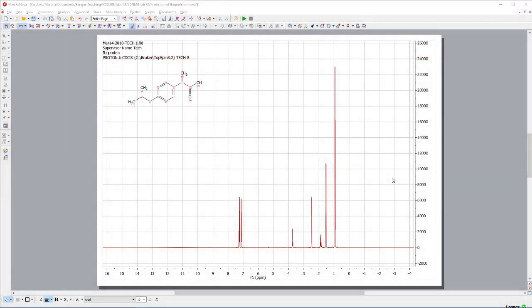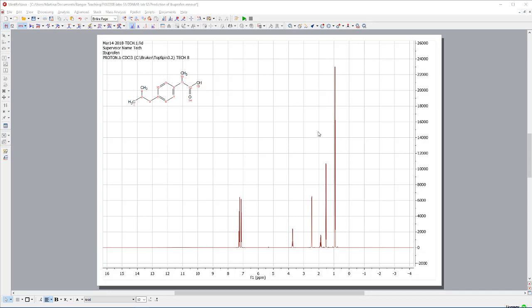To start with, I have taken a molecule you have met earlier, ibuprofen. That is a nice molecule because a lot of information we can actually gather already from the proton, and this helps us to understand the subsequent experiments a bit better. Starting with a very complicated molecule, if you have never done two-dimensional NMR spectroscopy, is quite tricky.